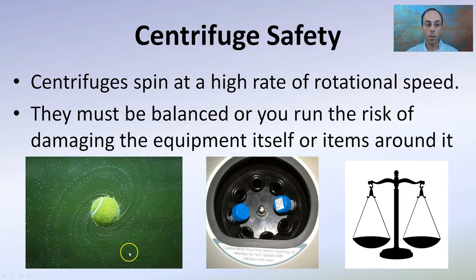Centrifuge safety: they do spin at a very fast rate — high rotational speed, in the thousands or ten thousands of RPM, or even higher in some cases. They must be balanced, or you run the risk of damaging the equipment, yourself, or items around it. Even if you want to centrifuge just one thing, you need to make sure the mass is the same on both sides. Otherwise it'll get out of balance, walk itself off the table, run into things, and can permanently damage the rotor and equipment.